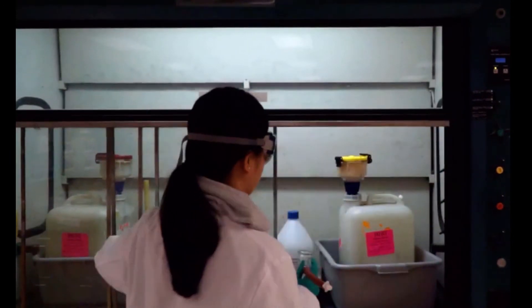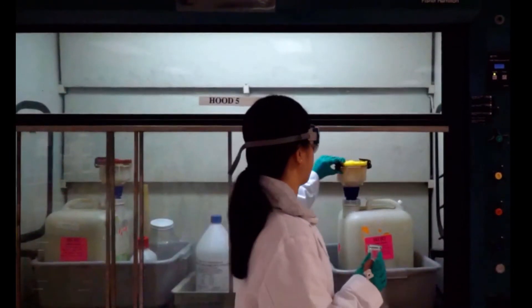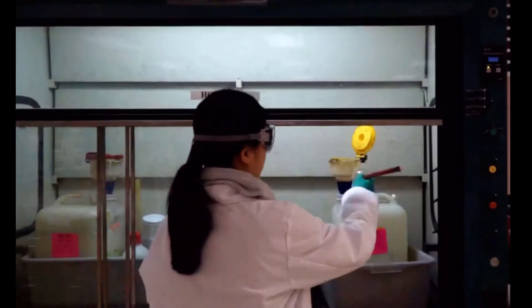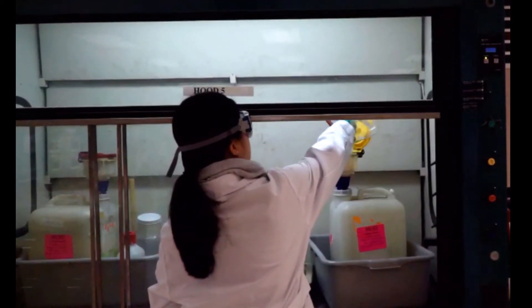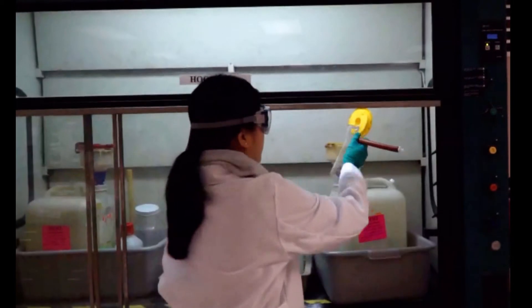You may dump the liquid from the filtration flask into the trap flask. Then you can take that flask and dump it into the waste bin. Always close waste receptacles when you're done using them.